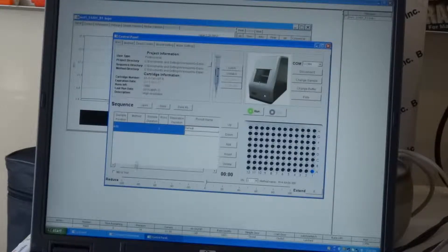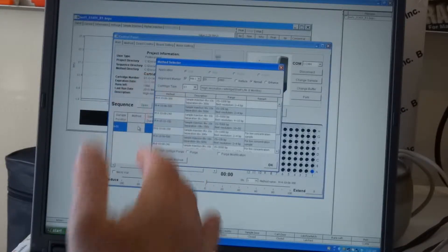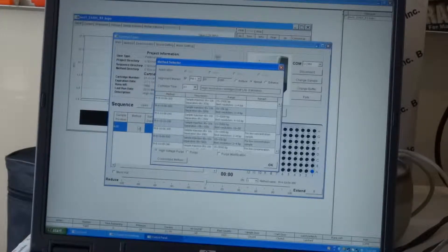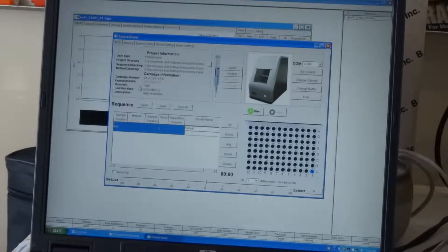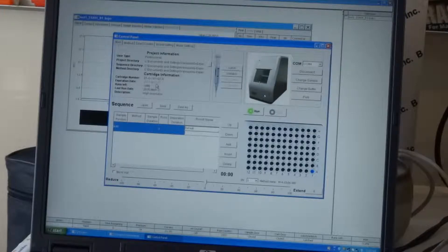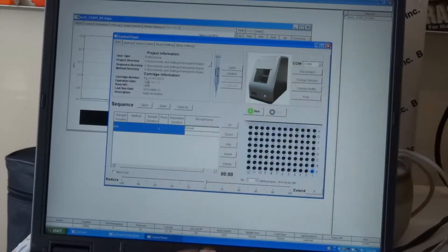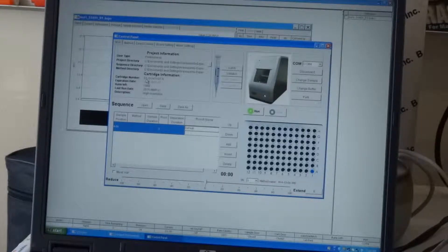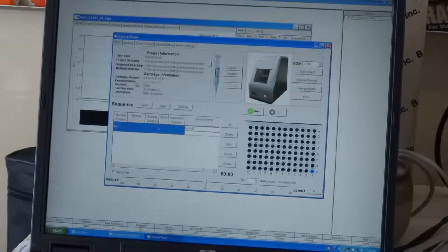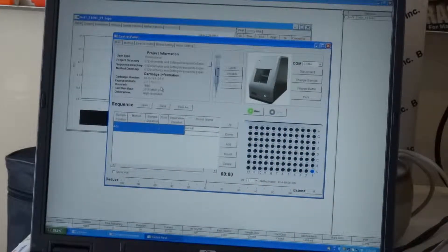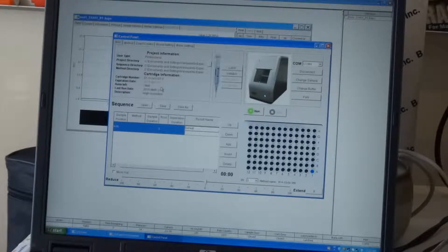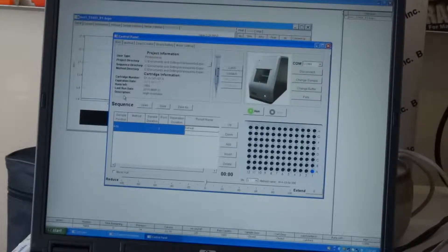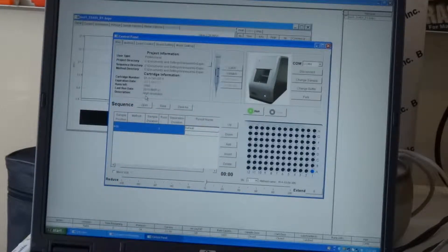Once you have selected sample position, then you need to select a method. Basically, the software already recognizes through the cartridge—there is an RFID built up in the cartridge. And it will display what type of a cartridge it is. By recognizing the information stored in the RFID chip, it will say it's an S1 cartridge. It has an expiration date, which is typically six months expiration, stored at room temperature. And also, the number of runs left and the description of the cartridge, which is, in this case, a high-resolution cartridge.